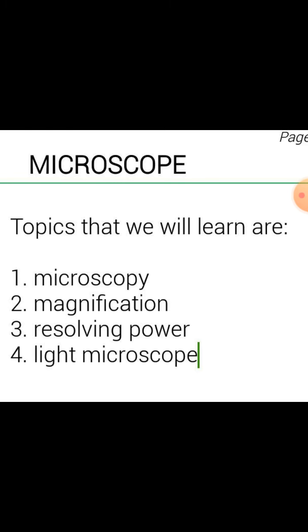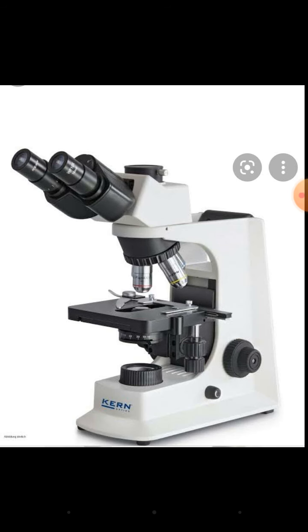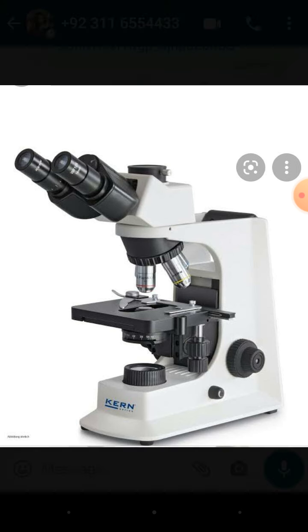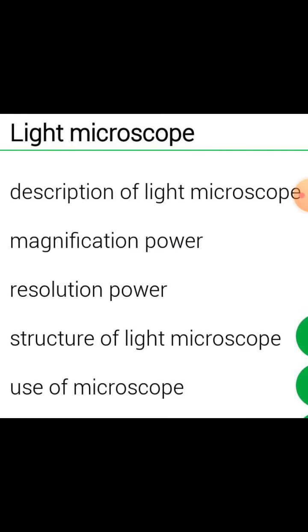Okay, next topic is light microscope. This is the picture of a light microscope. It's a modern light microscope of the 21st century. Okay, I will give you the description of the light microscope: its magnification power, its resolution power, the structure of the light microscope, and the use of the light microscope. First I will define the description of the light microscope.